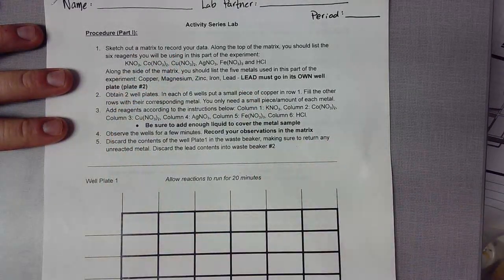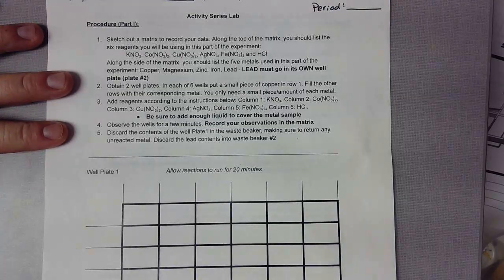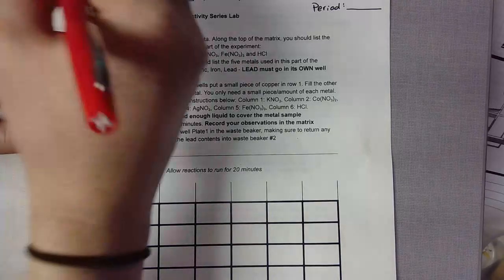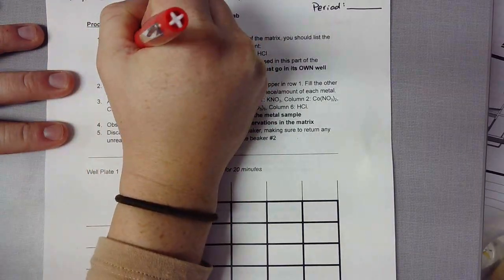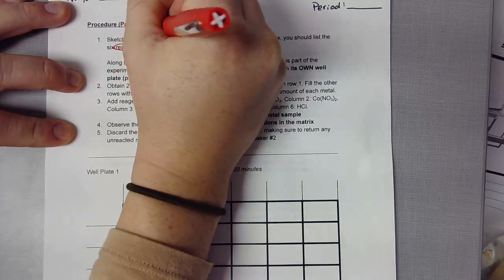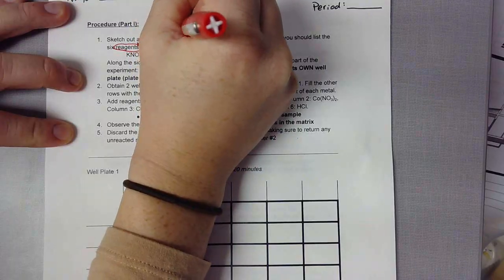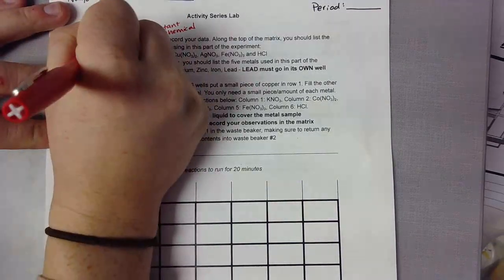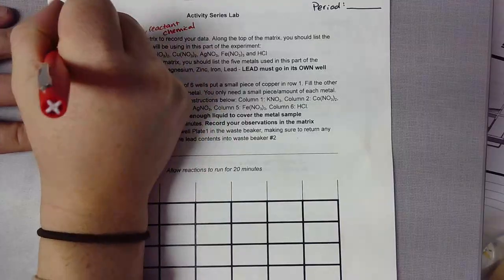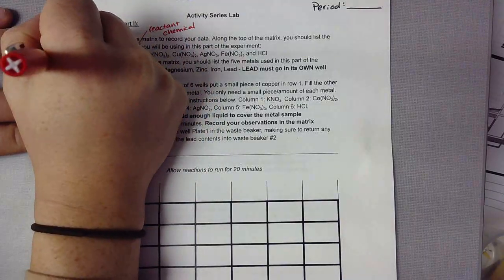The matrix has been provided. We just have to fill in the chemicals. Along the top of the matrix, you should list the 6 reagents. Reagent is just another word for reactant or chemical that we will be using in this lab. Now, we're using 2 different types of reagents. These 6 are our liquid reactants.